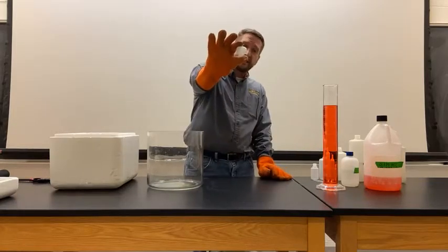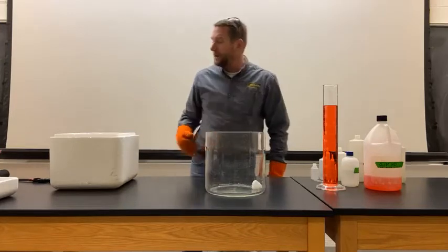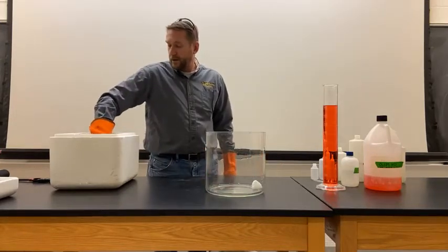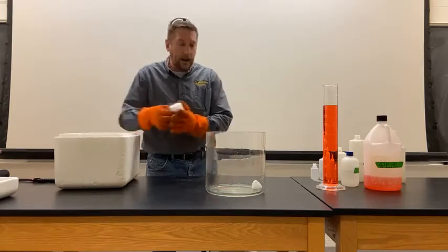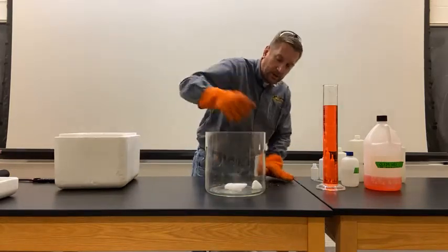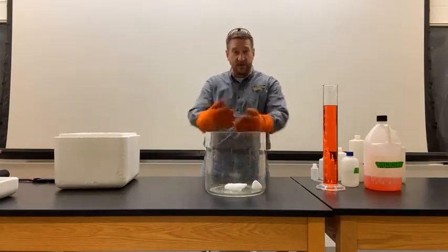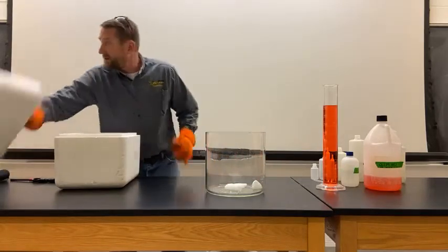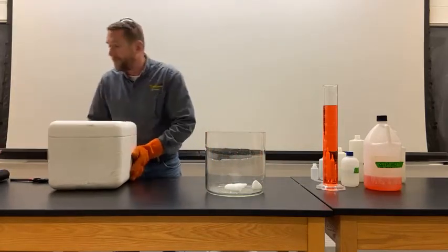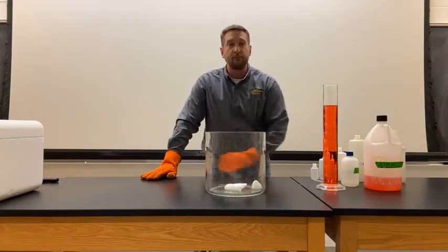So I'm going to take some of this carbon dioxide and put it here into our big bowl. And we're going to allow that carbon dioxide to undergo some sublimation inside of our bowl. One of the things also about carbon dioxide is that it is denser than air.